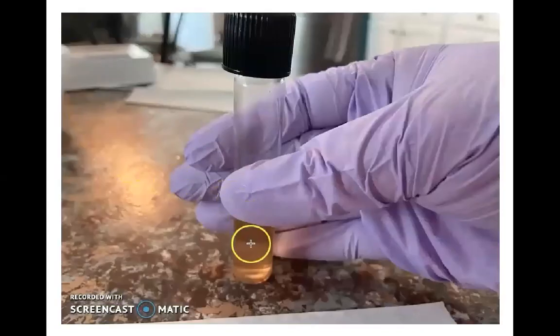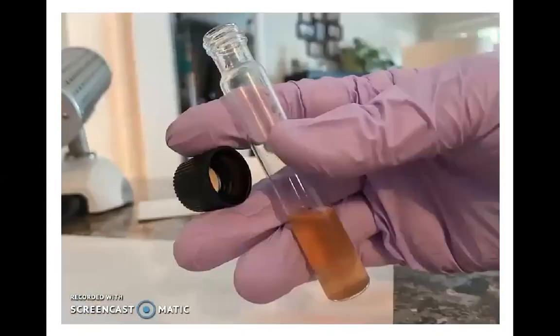So remember, when it's time to take out the culture solution with our inoculating loop, we want to make sure that we're handling the culture tube correctly. Remember, always with a gloved hand. We don't handle any culture materials with our bare hands. And we're going to always remember, once we open a container that has pure culture on it or in it, we want to tilt it so we make sure not to allow any microbes to accidentally fall in.